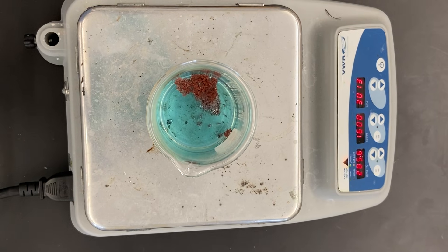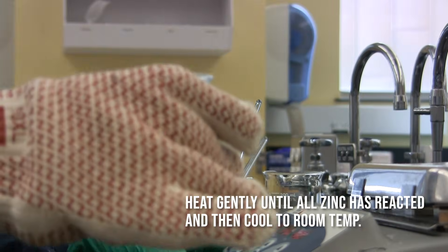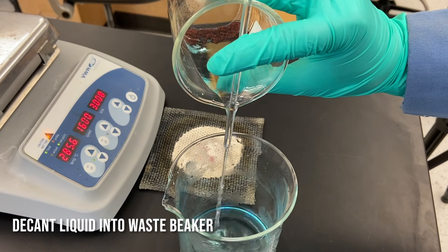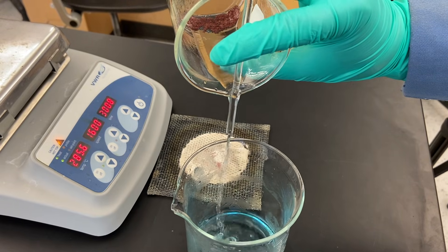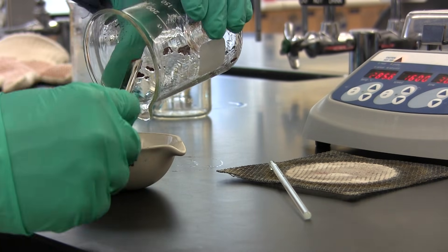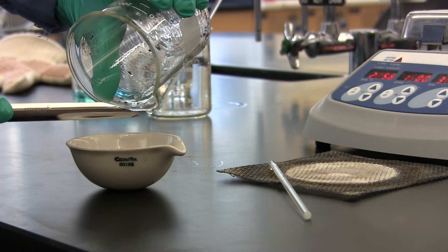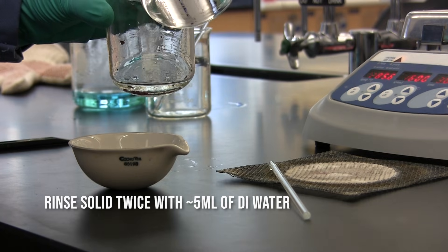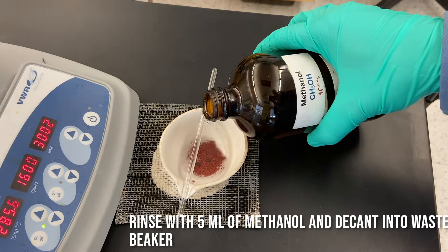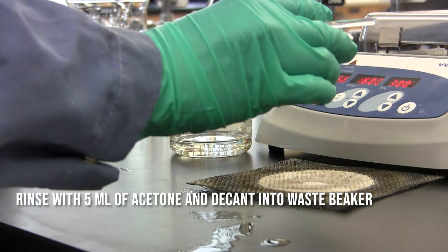Next, we're going to place the beaker onto a hot plate and let the solution heat — not necessarily to boiling — then allow it to cool and decant off the solution. This is also a good time to think about what kind of reaction was happening at that stage. I'm going to transfer the solid into the evaporating dish that I've already weighed, using my spatula, and rinse it in the beaker to make sure I got all the solid out. Next, we're going to rinse the solid with portions of methanol and then one final time with 5 ml of acetone, then decant those off.